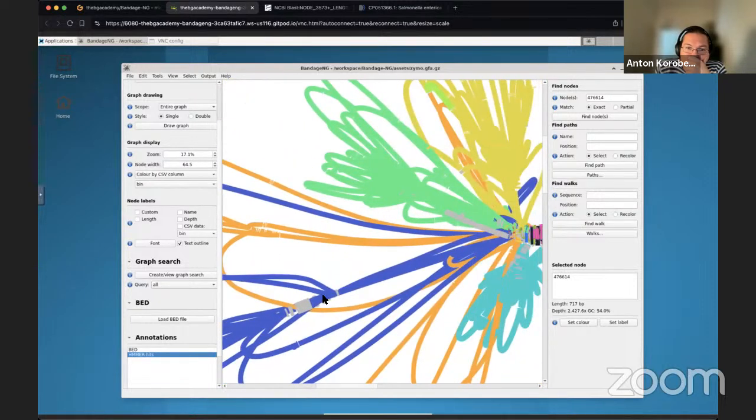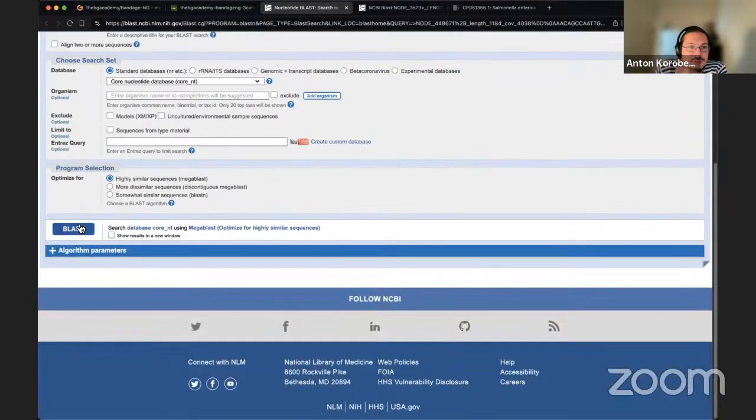Certainly we do have some unbinned pieces here, and if you want, we can even manually enrich our MAGs, right? So this probably was just too short, but we can double check what's going on and see who this guy is.